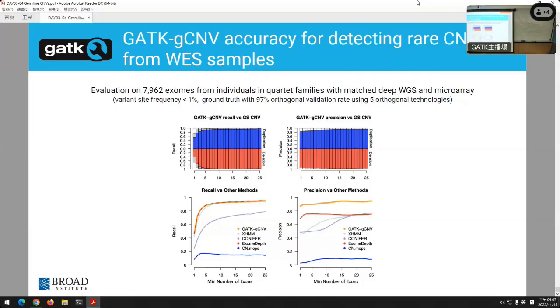One more question. Because in the hospital, they always collect the patient. Could we use patient samples as well-matched samples? They don't need to be controls, if that's what you're asking. You could get a whole group of case samples or patient samples and run them through GCNV together as long as they were sequenced the same way. Okay, thank you.